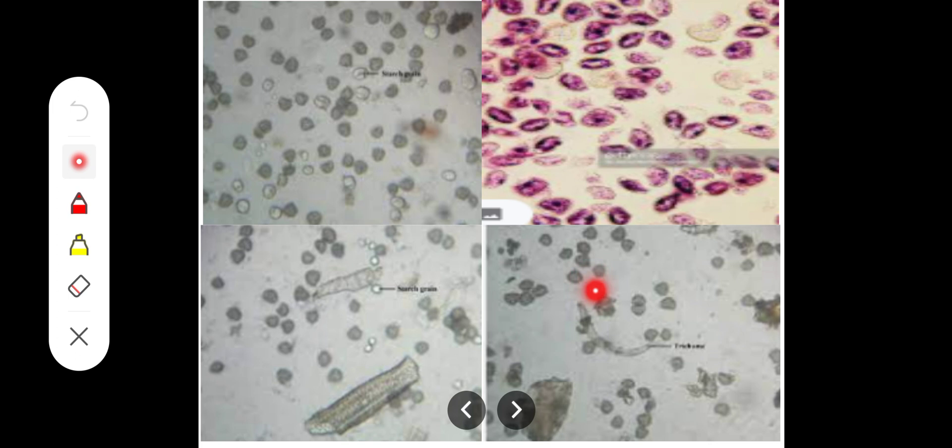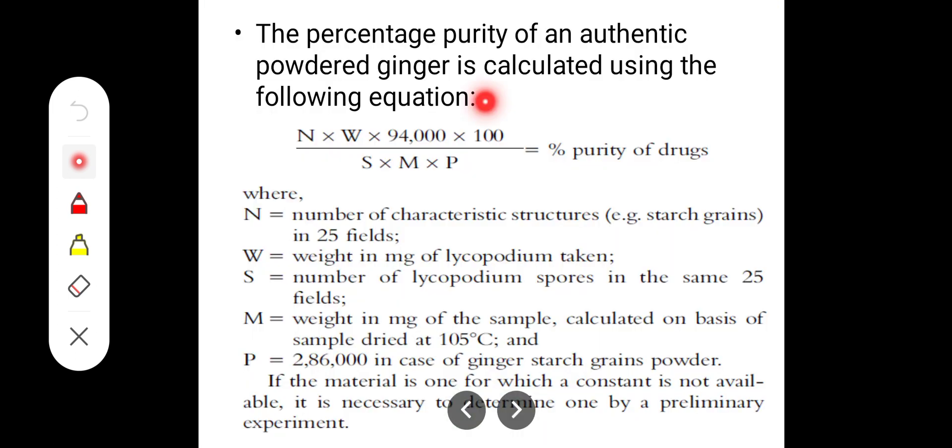Lycopodium will look similar in shape and size and dark in color. All will look the same size. The particular starch grains you can find out. We can count those in 25 fields. Remember, in 25 fields we count the number so that we can put it into this formula and get the percentage purity for the particular drug.